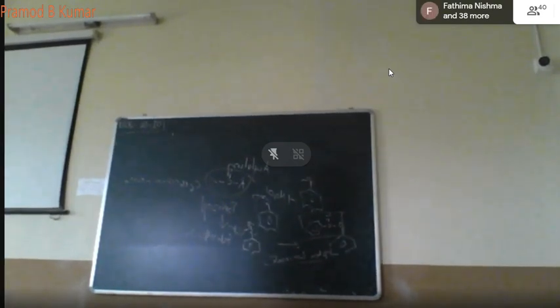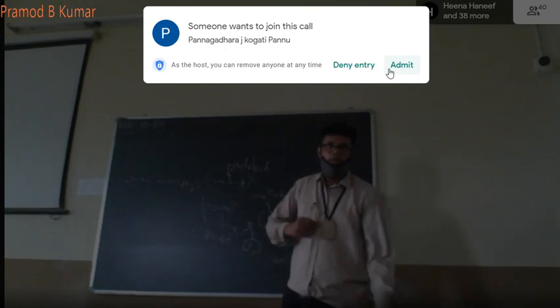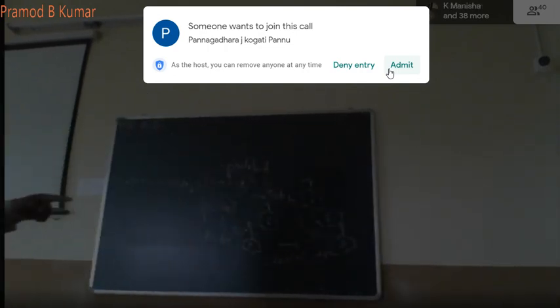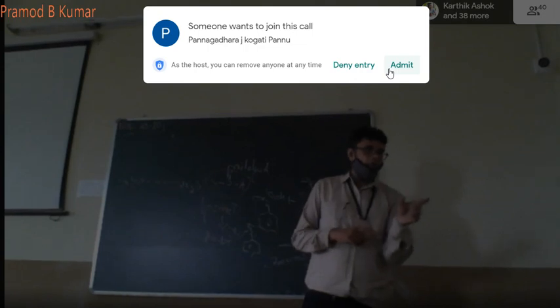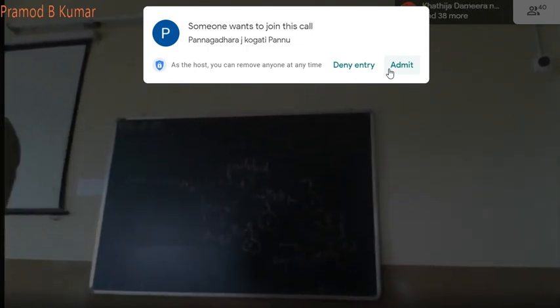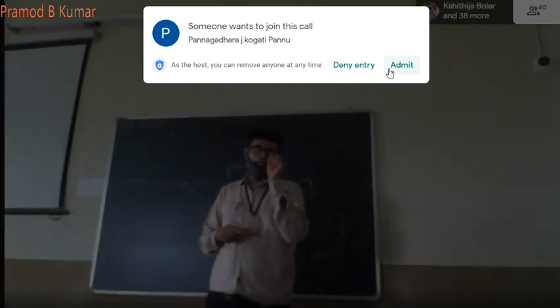What type of reaction is it? Everybody make a note of it. It's an acylation, esterification. The basic reaction is acylation, benzoylation, because a benzoyl group is added, and it is an ester because the functional group formed in the end product is an ester. That's why it is known as esterification. Got this? The first reaction. Everybody understood? So it's an acylation, esterification.